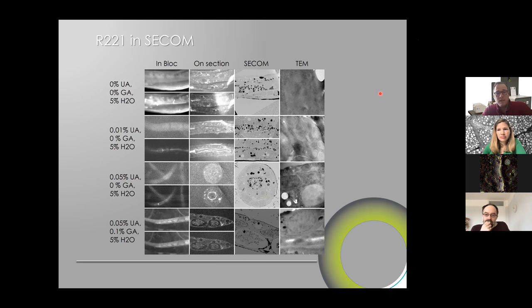So, thank you, Matt, for this suggestion. I did not try it again. This work was a side project for me. I was working mostly on the high-pressure freezer that you see behind me in the presentation, and I wanted to have this resin extra. So I must say it was not a 100% full-time job. But this is very interesting, obviously.